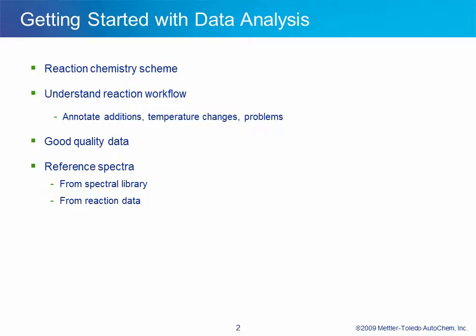Good quality data is very important. Again, as you learned from the previous webinar, we would love to start with good high signal to noise data and data that is free of water vapor.